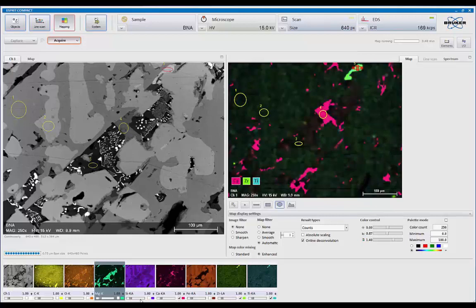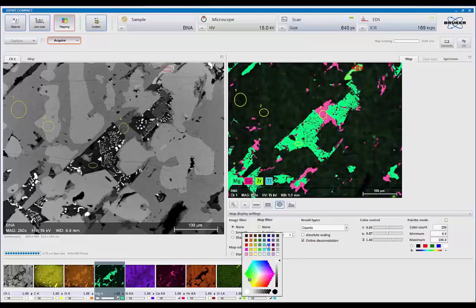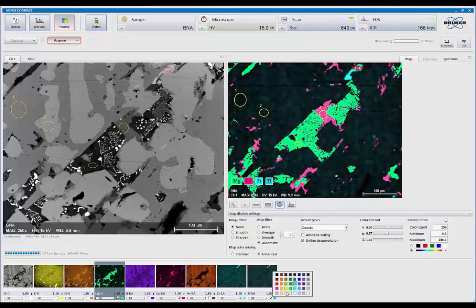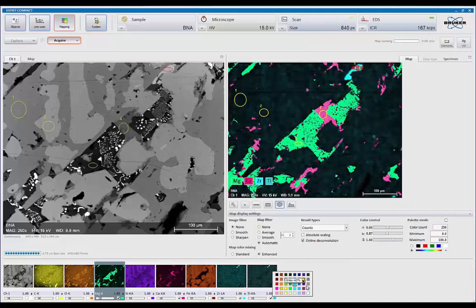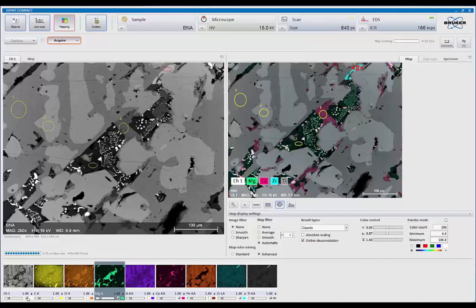Let's start bringing back our other elements. I'm going to change the color zirconium to a nice aqua so it makes it stand out. And the titanium will make a magenta. Now we'll make it a gray. And let's bring the image back in. Do our composite.